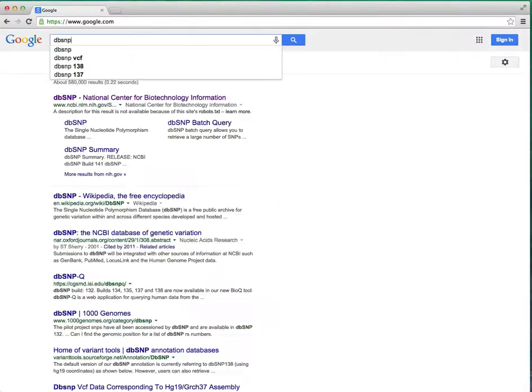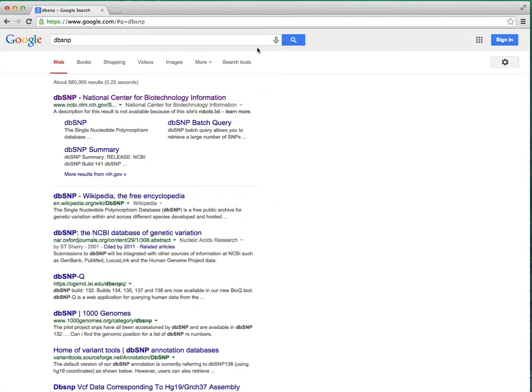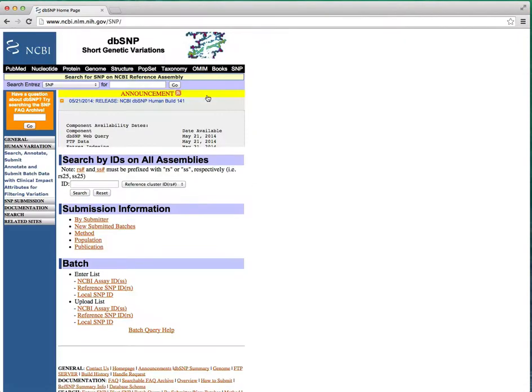To get to the dbSNP website, search Google. It should be your first hit. The dbSNP name is a bit misleading because it does contain more than SNPs. As the home page says, it contains short genetic variations.